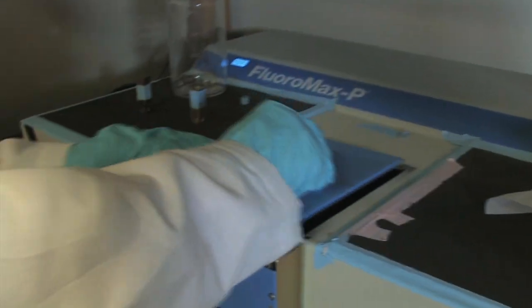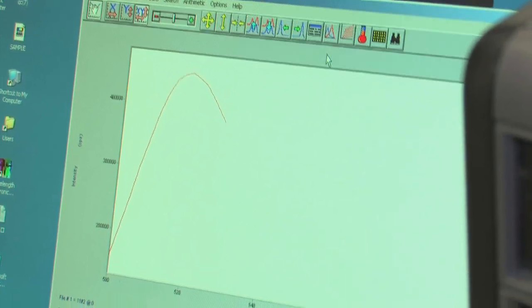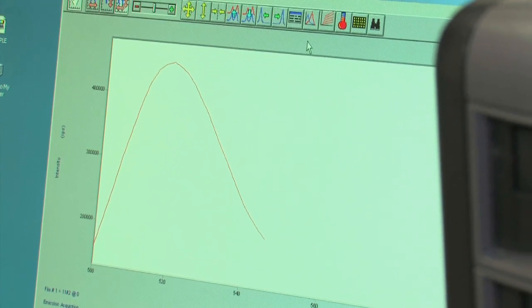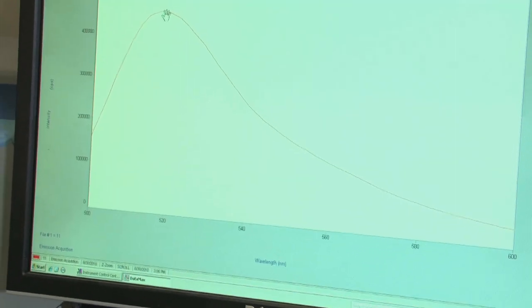The sample is in, and we just need to operate the software to detect it. This is the intensity for our blank sample. The number is here. It's like 400,000. You can remember its value.